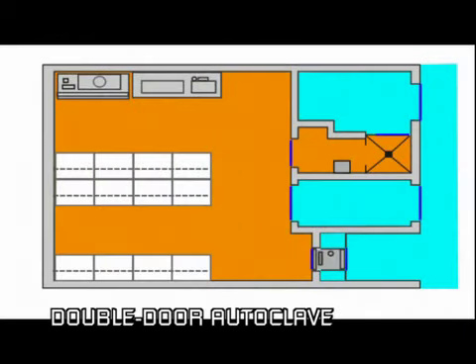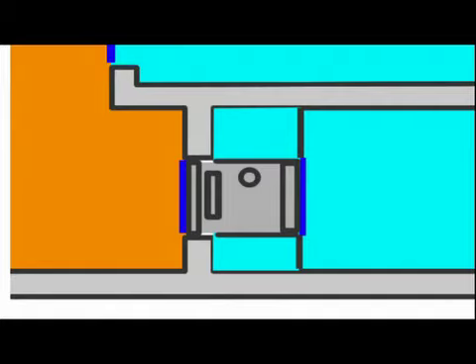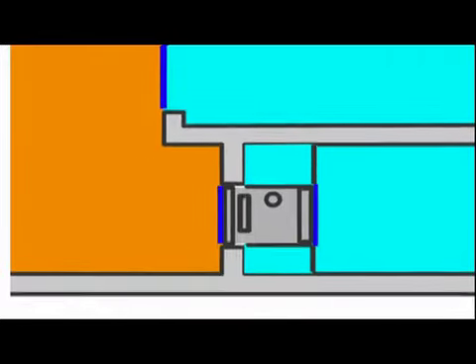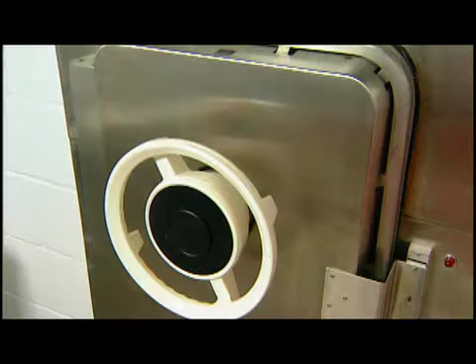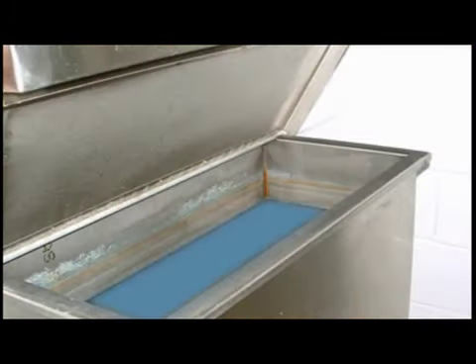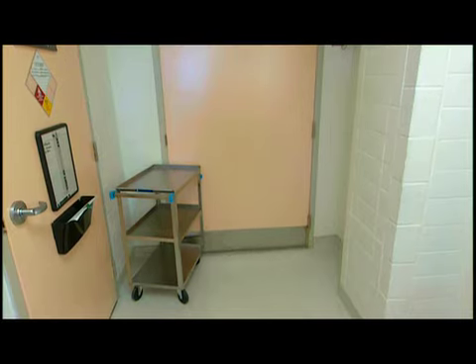As part of their containment perimeter, all Containment Level 3 labs working with pathogens that are infectious via inhalation must have a double-door barrier autoclave with bioseal. As always, an interlock system prevents both doors from being opened at the same time. Also, for easier maintenance, the body of the autoclave should be located on the clean side. All materials that come out of the lab must pass through the autoclave or through some other proven decontamination technology. The lab must also have a door large enough to accommodate whatever equipment needs to be brought into it.